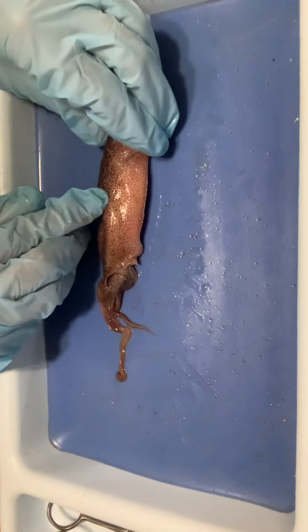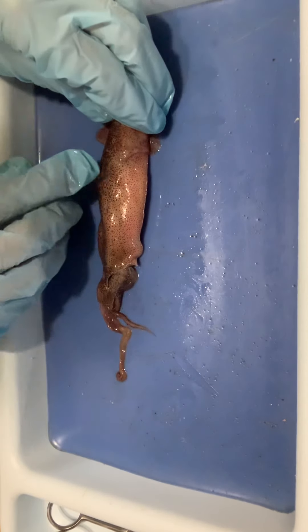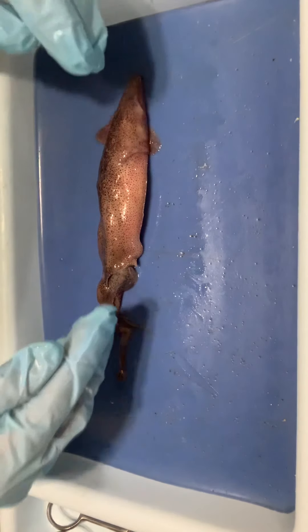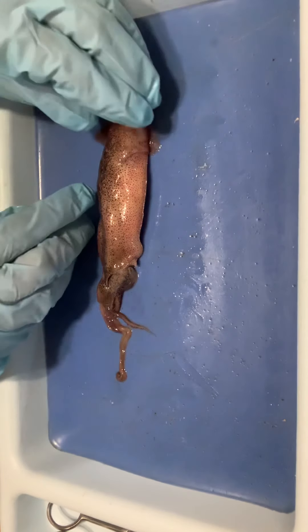We have our chromatophore cells — all the little dots you see on the squid are chromatophores. Those are what allow for color change in this little guy, so he can deal with camouflage and things like that.